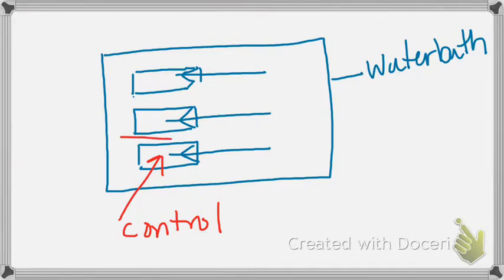And then I want you to have as many experimental respirometers as you can. I think the limit we're going to run into for this lab is that it will be difficult to get it set up fast enough. So you need to make sure that you really know what you're doing on Friday when you come in.